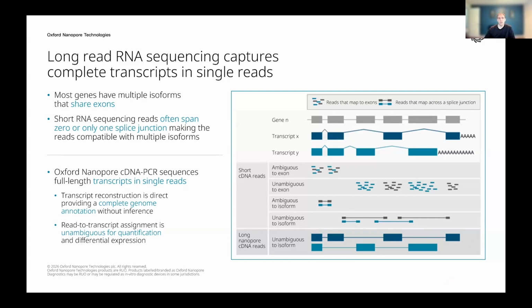The same principles of the value of the long read apply to structural events such as gene fusions as well, because you can detect the fusion with short read, sure, but with a long read, we can capture the surrounding transcript context as well. So we can capture a lot more that's on either side of that fusion event.